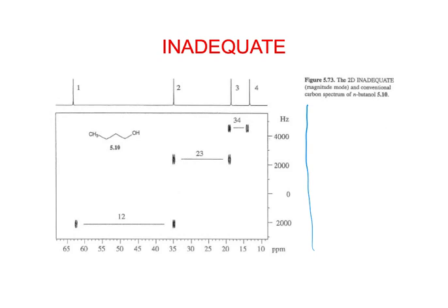So the NMR has a transmitter frequency that's usually set in the middle of the spectrum. So this is the offset from the transmitter frequency, so it's always just the difference from the transmitter frequency. So it's a weird axis, but down here we have parts per million.